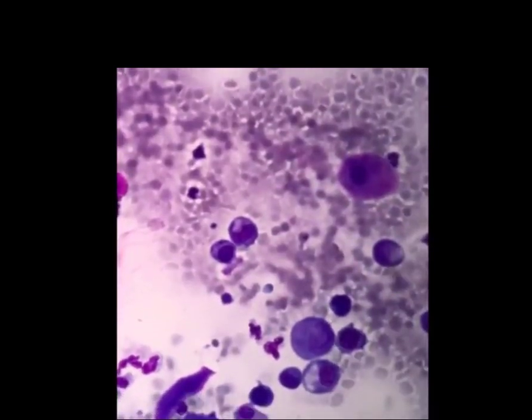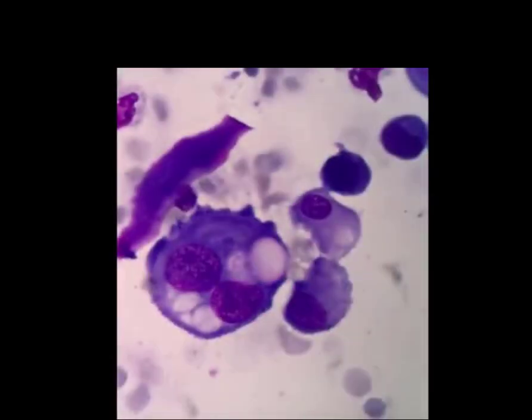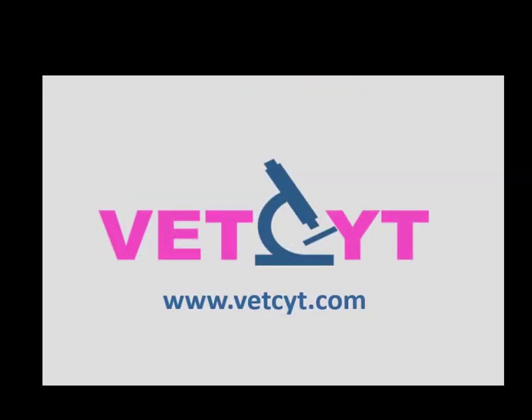We change the field of view again, and what is interesting in this cell is that they have vacuoles with a pink granular contents, classical for transitional cells, which you will remember from the very first presentation in this series of the prostatic carcinoma. So, thanks to an ordered approach, we have been able to diagnose Sheepy with the transitional cell carcinoma of the bladder or urethra. However, it is important to remember that not all transitional cell carcinomas seed into the urine, and you can miss the diagnosis if you rely on urinalysis alone.